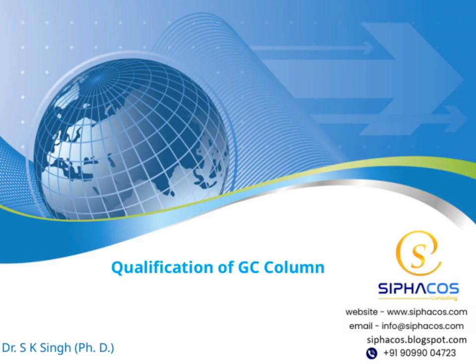I'm Dr. S.K. Singh, and I'm pleased to have the opportunity to share some insights with you. Today, we will be discussing the qualification of GC columns. Over the course of this presentation, we'll explore what GC columns are, why their qualification is important, and the key aspects involved in ensuring their proper functioning. I look forward to guiding you through this topic and hope you find it informative and engaging. Let's get started.